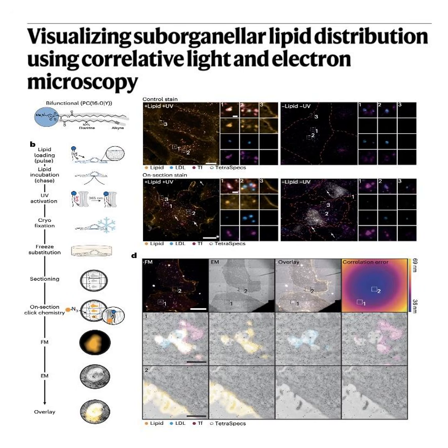Because it's like trying to study the natural, stealthy behavior of an undercover spy, but before you observe them, you make them wear this giant, glowing neon sombrero. That is a fantastic analogy. Yes. They can't slip through doorways, they bump into crowds, they just get stuck. So the physical bulk of the tag actually ruins the experiment? It changes the molecule's behavior entirely. The lipid transport deviates from how a native lipid would act in the wild.